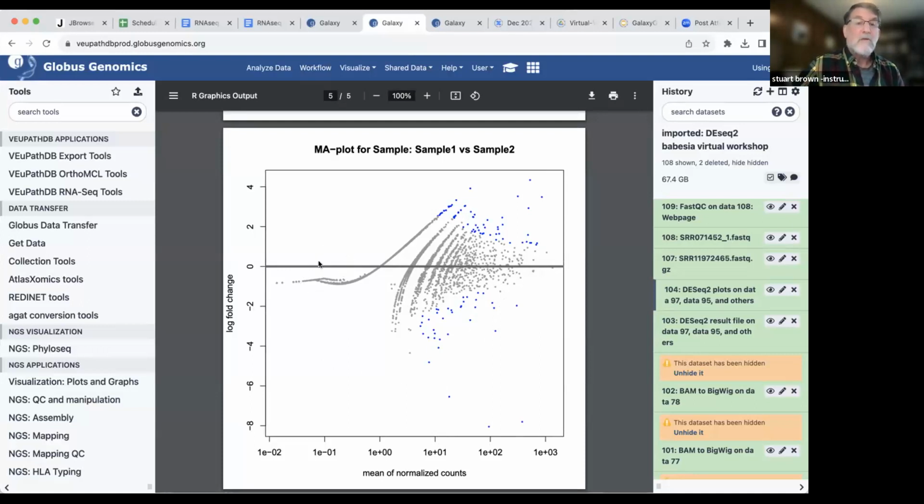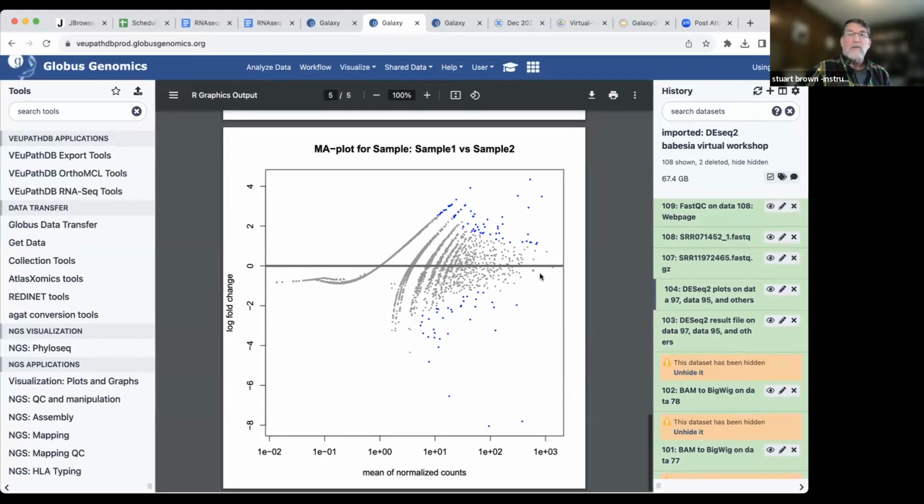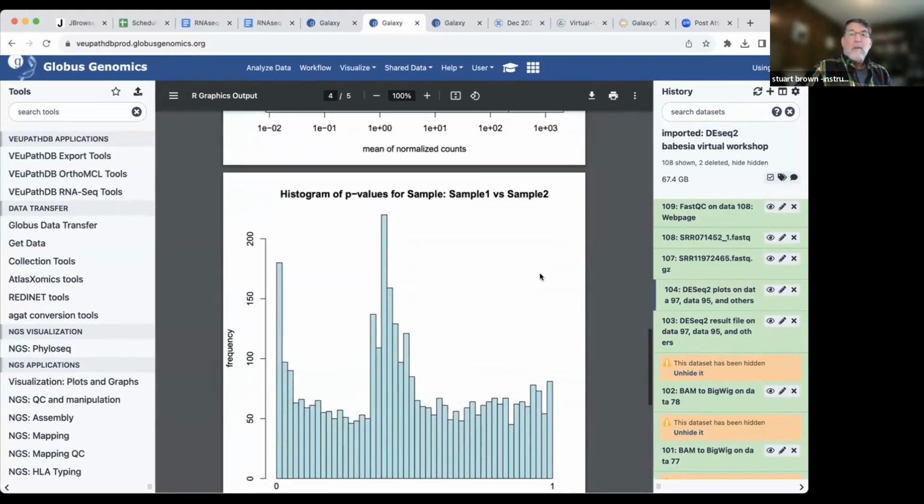And the ones that are extremely low, having one or very, very few counts per gene, are not differentially expressed because there's not enough variance there to do the calculation and show them being differentially expressed. So that's all good. The normalization and the statistical methods have suppressed variance in the very low count genes, and we get a good amount of differentially expressed genes from moderate to high expression levels. So this stuff looks all pretty good.